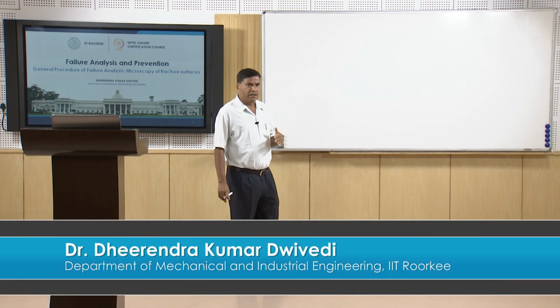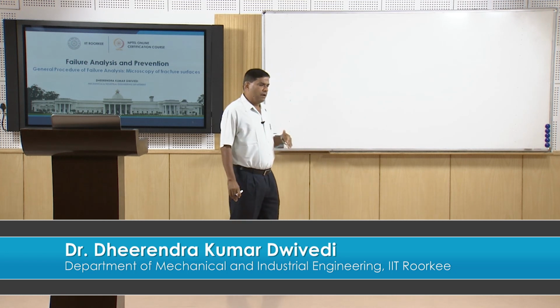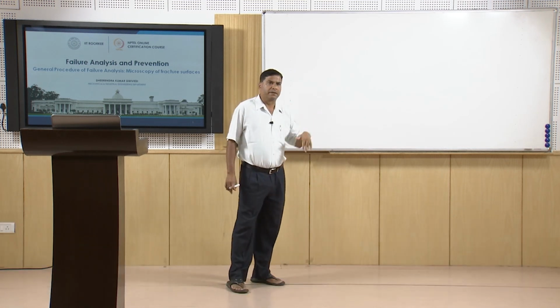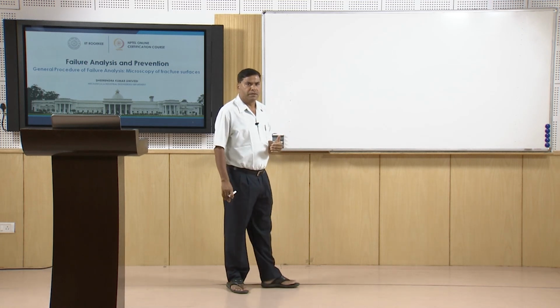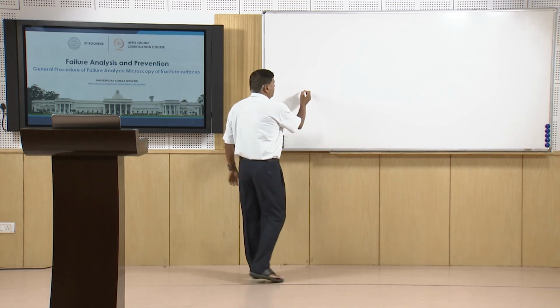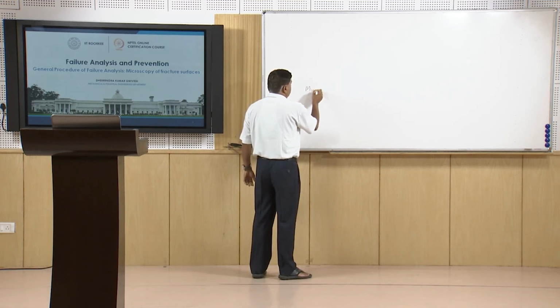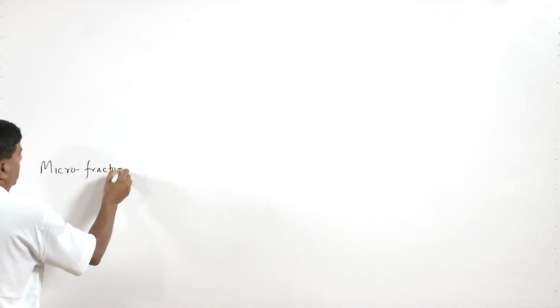In this subject, we are talking about the general procedure of failure analysis. We have talked about various aspects related to this procedure, and in this presentation we will be talking about the microscopy of the fracture surfaces, which is also called microfractography.